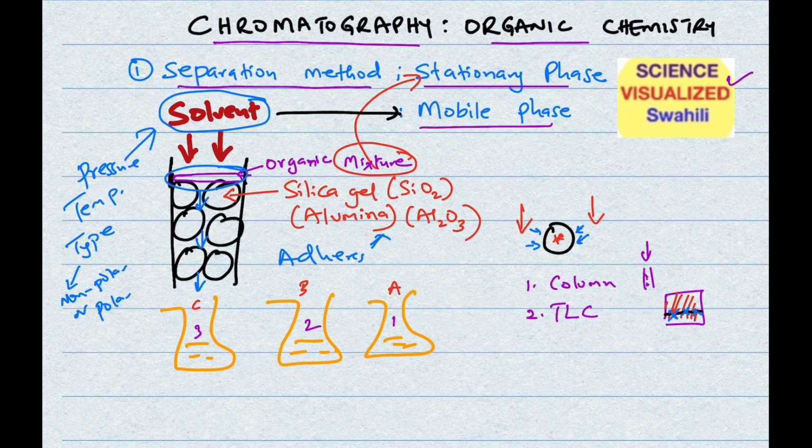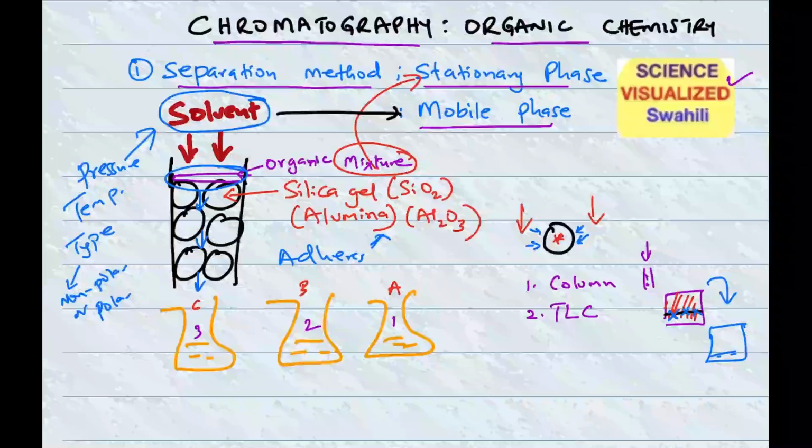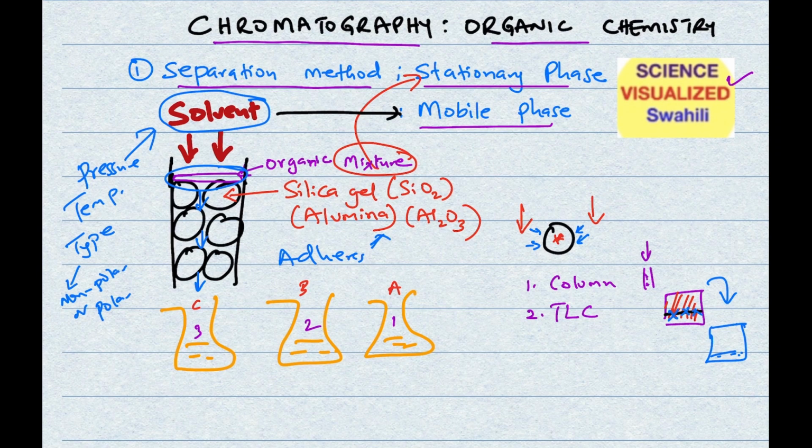Then after that, you place that into a beaker that has a solvent of a particular polarity. So you have the TLC plate there, and then the solvent will move up the plate, and the end result is that now you have a TLC plate, but now the mixture has moved. You've ended up separating them, and that will show you how many components that mixture contained.